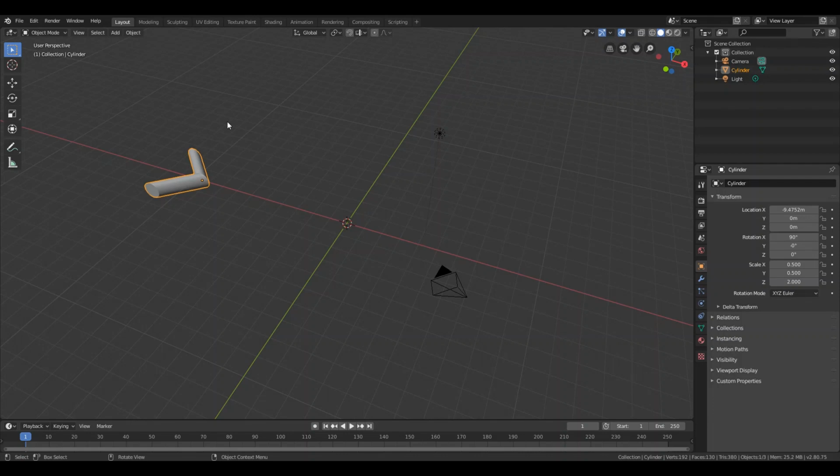Traditionally the first ones, the ones in the microscopes in the 1950s and maybe later, 1970s or something, I don't remember the dates now, but the first ones were of tungsten. So the W on the periodic table.